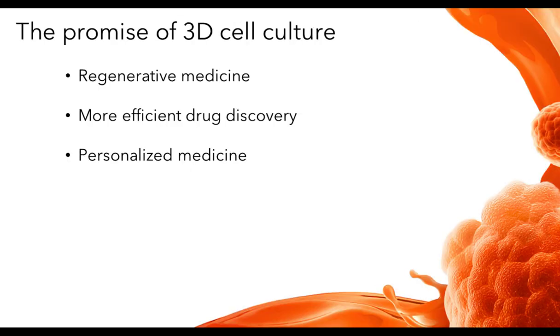So in conclusion, the promise of 3D culture is in 3 areas. One of which I've touched on is more efficient drug discovery, but it also holds promise for looking at regenerative medicine, and it also has the ability to speak to the area of personalized medicine, since many cells from individual patients can be grown in 3D, and as a result you can personalize both a disease model as well as the effect of the compound on those patient cells.